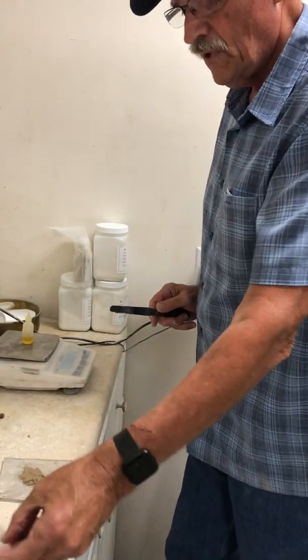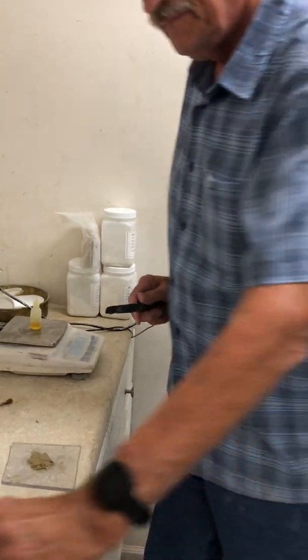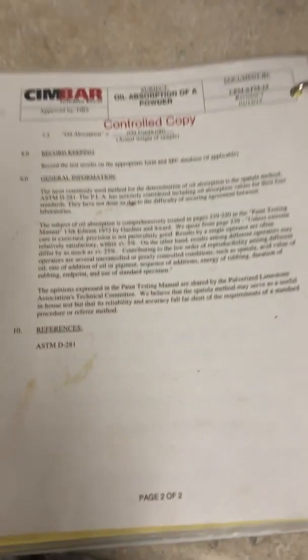So you've got the weight — 5 grams — and you've got the oil. Use your calculation on your test method, and that should give you the pounds of oil that will be absorbed into a pound of product.